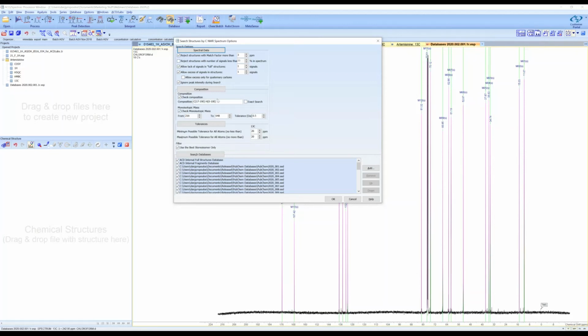And chances are that if you are looking for something unknown, and you have the molecular weight, you have probably run a mass spectrum. In this case, I'm going to set it from 351 to 352 molecular weight, because that's the molecular weight of retrorsine that we have here. And here we have now all the database files that will be searched. Obviously, 99 million entries cannot fit in a single file, so we have split it in quite a few files. And yeah, that's about it.